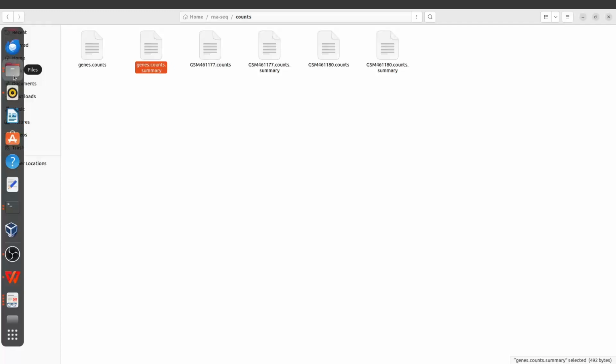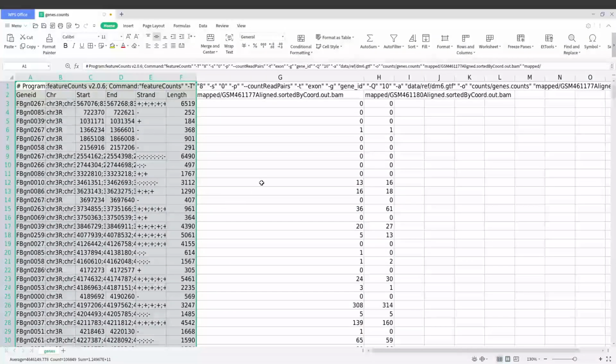Okay, so I repeat, once you have your file, your output file, you need to do some processing before you can now push it to the differential expression analysis tools to do the downstream analysis for you. Okay, so if you are interested to learn how to perform differential expression analysis using DESeq2, then watch this video right here.